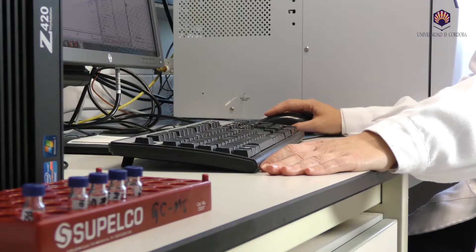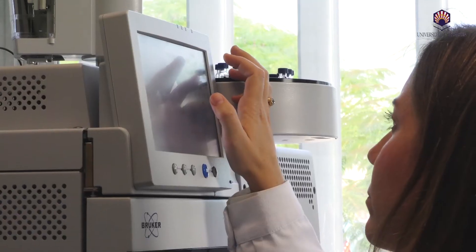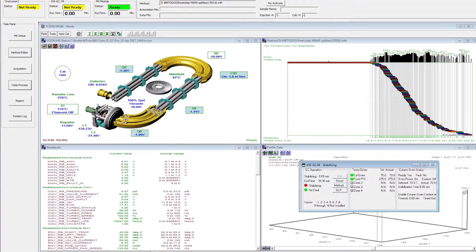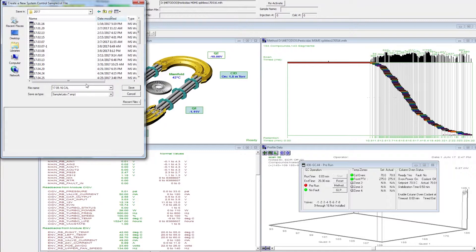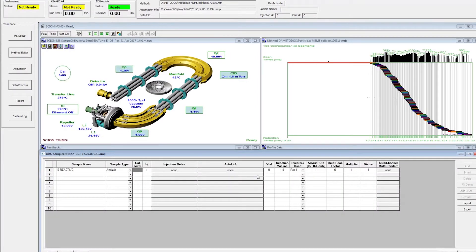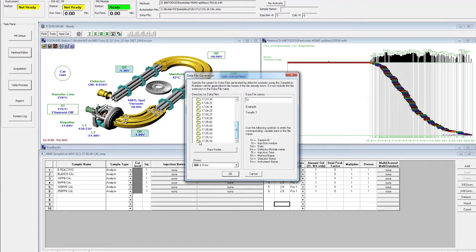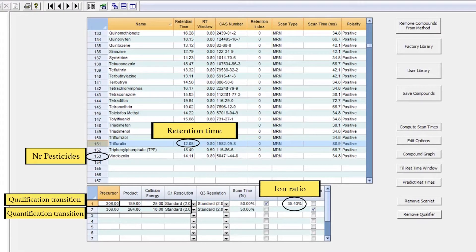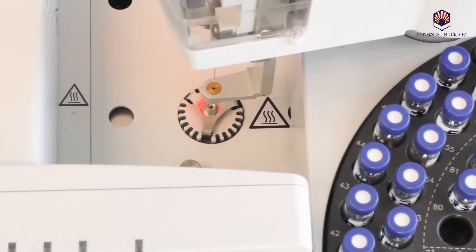After preparing the samples and prior to injection, we verify the instrumental parameters of both the gas chromatograph and the mass spectrometer, observing that all parameters have correct values. To proceed with the analysis of the samples, the sequence is created in its corresponding folder. First, we inject the reagent blank, specifying both the position of the vial and the volume of injection. Then we put the different standards for the calibration curve and select the folder where the data will be saved, and the MRM method of analysis, which contains the specific conditions for 153 pesticides, such as expected retention time, transitions for quantification and qualification, as well as their associated energies and ion ratio value, that will confirm the unambiguous identification of a pesticide. Once the GC-MS is ready, the analysis of the samples will begin.